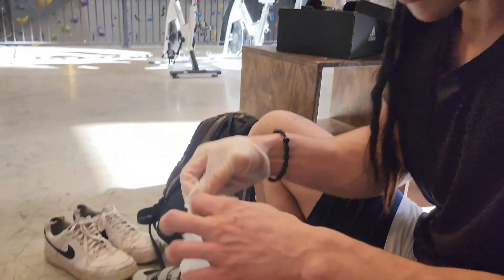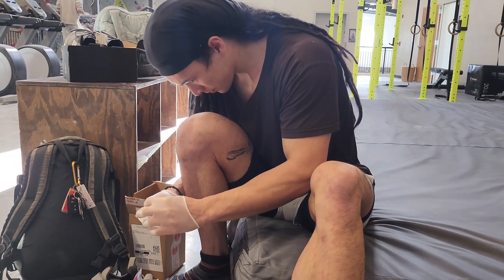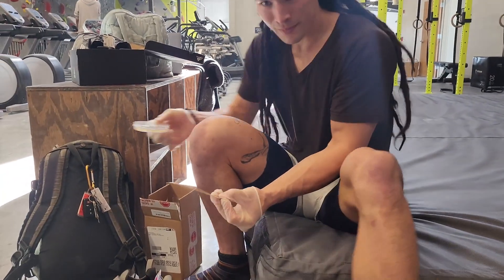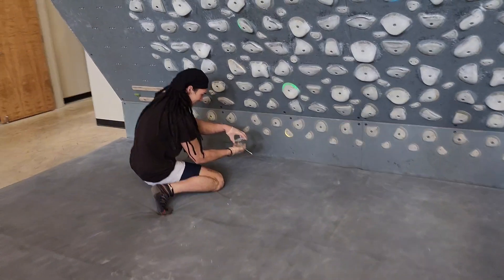Despite my inexperience I will still try to keep things as professional — or as sanitary — as possible. I do end up wearing gloves and I switch swabs of course, and later I try to isolate each of the petri dishes. And then here is where you caught me at the intro of the video, swabbing these climbing holds.